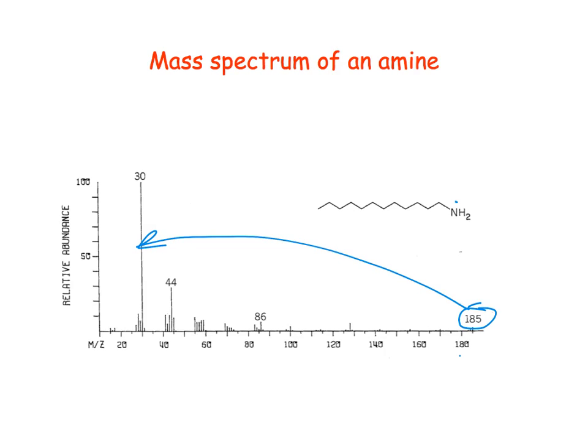This is just for primary amines like this. It just does this alpha cleavage, and the predominant ion is just like this, 30, plus the radical. Amines do mostly the alpha cleavage. They don't do so much of the cation initiated because they're better at donating like this. They're better at holding this plus charge on the nitrogen, even better than oxygen is.